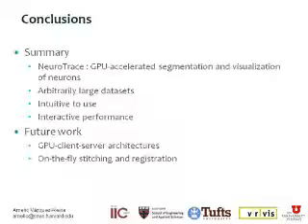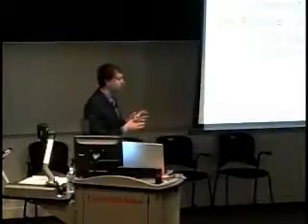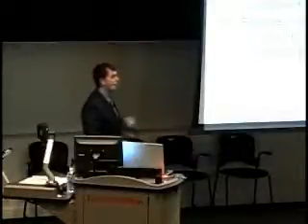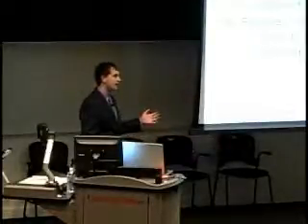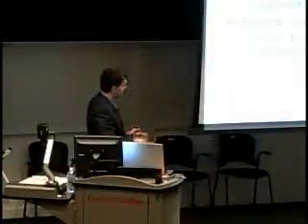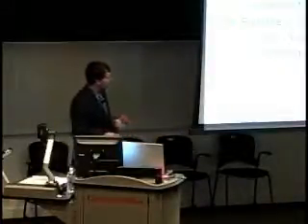So, in conclusion, these are the take-home messages from the talk. We have presented NeuroTrace, a GPU-accelerated framework for both segmentation and visualization of neurons in EM datasets. We can handle arbitrarily large datasets because we are only accessing those pixels that are needed for segmentation, visualization and tracing. It's intuitive to use, and it also provides interactive performance.